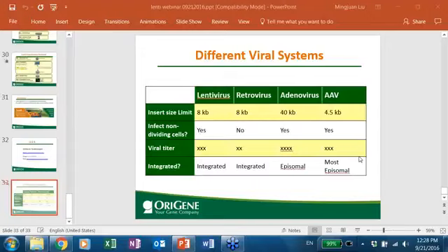One question says that the GFP control always has higher expression than the gene of interest fused with GFP. This is normal because the GFP is a C-terminal tag. The expression of the fusion protein depends on the expression level of your target gene. It depends on the gene; the translation efficiency and the protein stability are different. Therefore, for different genes, the steady state protein level will be different.